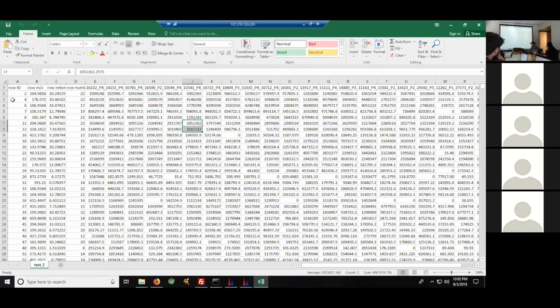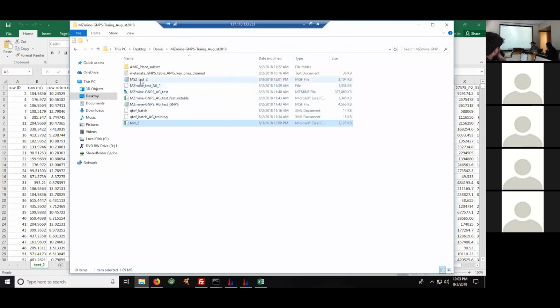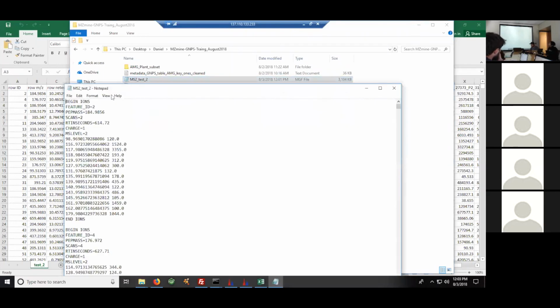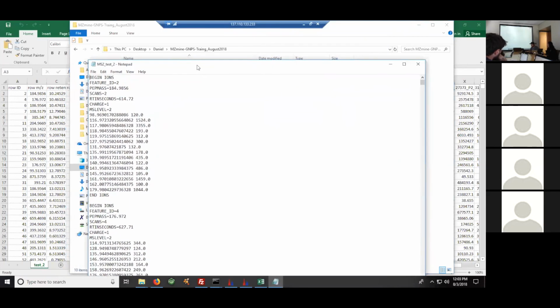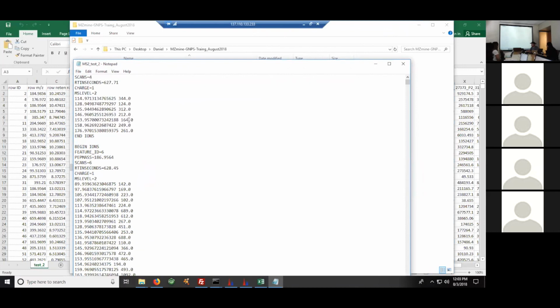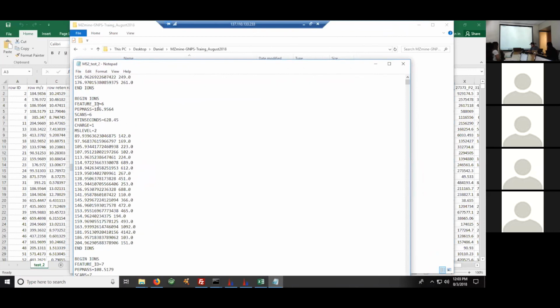And then according to this row number, I will get MS2 spectra in the MGF. I can, for example, open this with Notepad or so. And then you can see here the MS2 spectrum with the ID 2 was from mass 184, so that corresponds to the mass here. And if I scroll further down, you can see ID 6 is 186 and so on. So that's basically our link. And now we can take these files and throw them into GNPS, which Ming is going to show you.